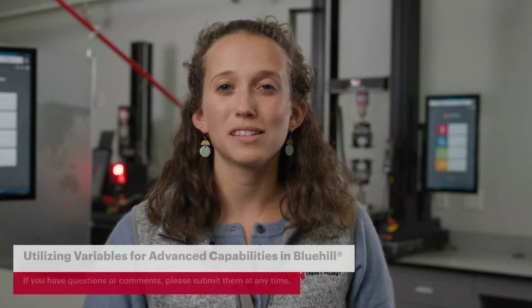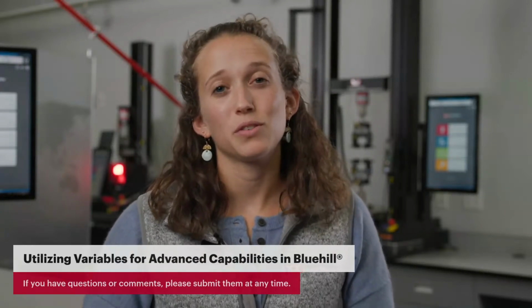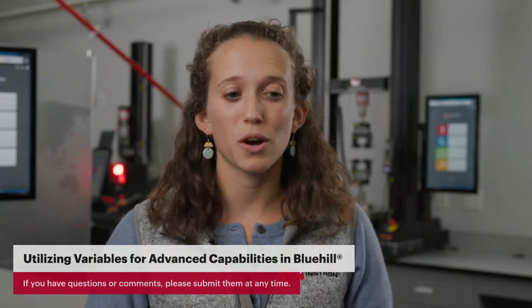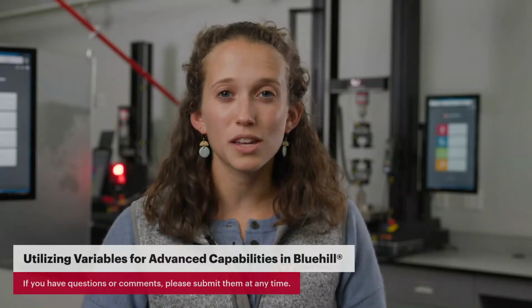We are going to deep dive into some advanced capabilities within Bluehill's TestProfiler module, specifically talking about the use of variables. This session is really intended to help all of you, so please feel free to throw any questions you have in the chat or any other interesting use cases that you think of, and we'll take a look at that toward the end of the session.